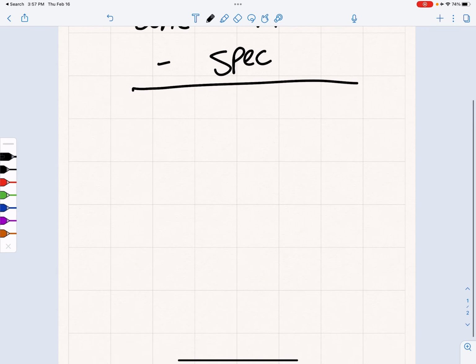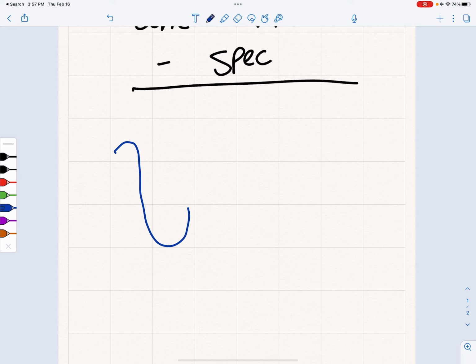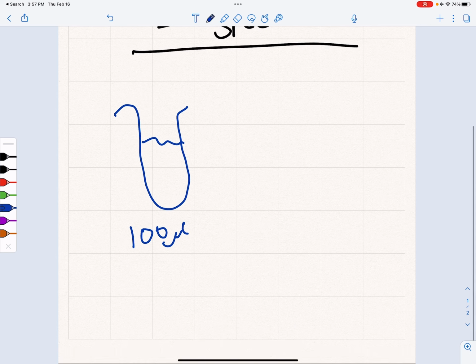Okay, so if you remember, we resuspended our DNA pellet in 100 microliters of TE buffer. However, we don't know the concentration of the DNA that we isolated. So we want to know the concentration. As we talked about in lab, the concentration of DNA extracted will be too high to accurately measure using the spectrophotometer. So we do a dilution, if you remember, into a cuvette.